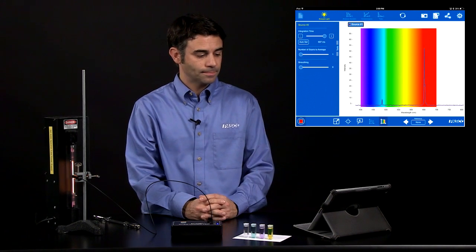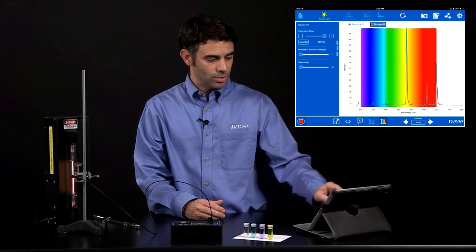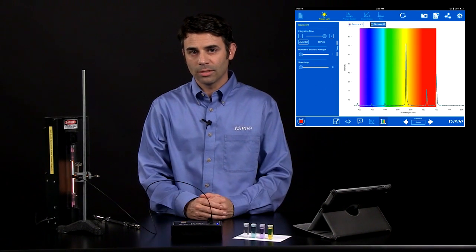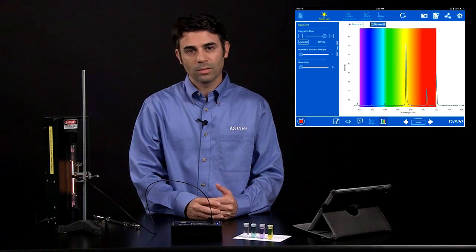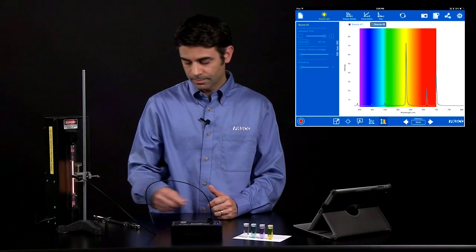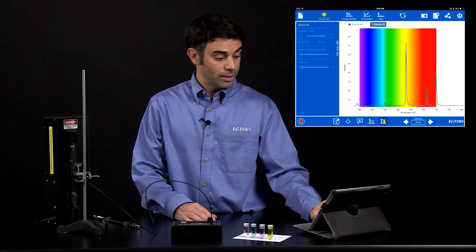I'm going to replace my hydrogen spectral tube with helium. Both are very common, quick activities for physics and chemistry classes. I'm going to hit start again. Integration time should be pretty good based on the hydrogen. Now we have a different set of peaks based on the different emission lines for helium. I'm going to stop.